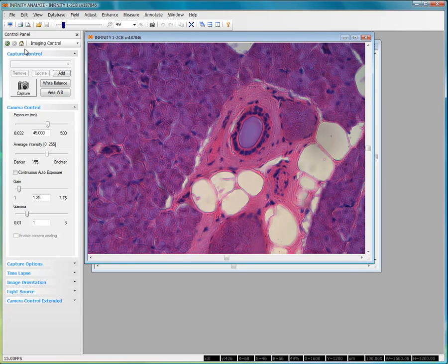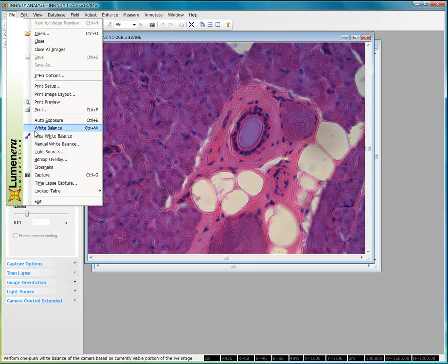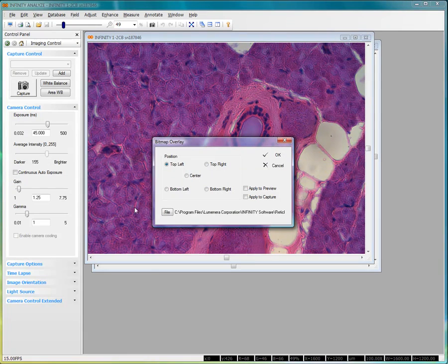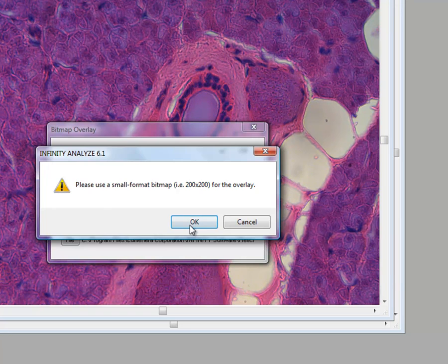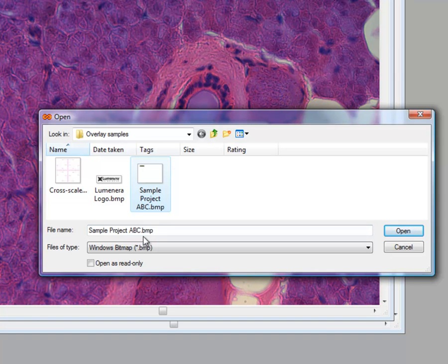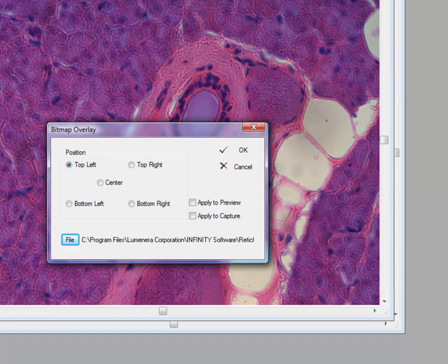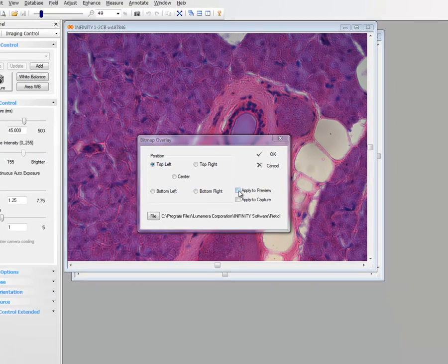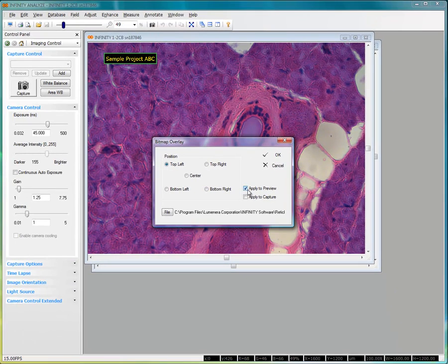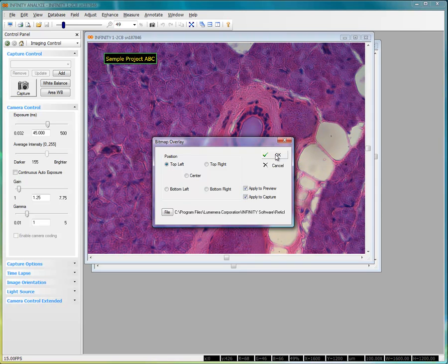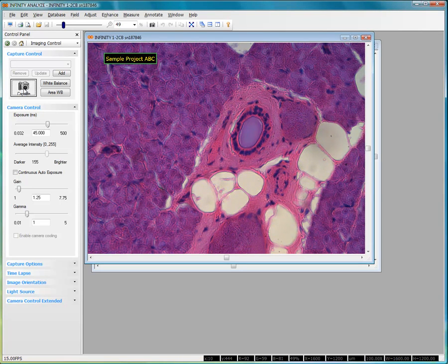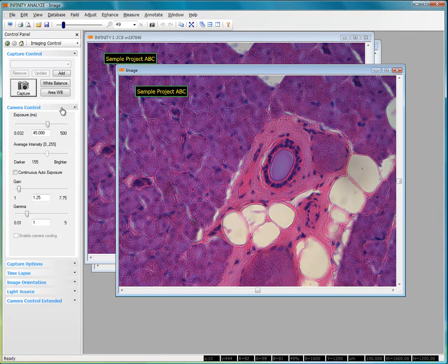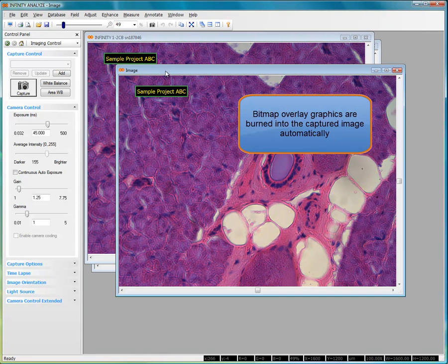Once we've generated the bitmap overlay, go back to the File menu and click on Bitmap Overlay, and now click on the File button, where we can then select the file that has our sample project bitmap in it, and click on the Open button. Once the file's been loaded, we can select Apply to Preview, and it appears on our Live Preview. If we want that sample project ID to appear on our captured images, then we select Apply to Capture, say OK, and now any time we capture an image of our samples, we'll see that the bitmap overlay has been added automatically into our image.